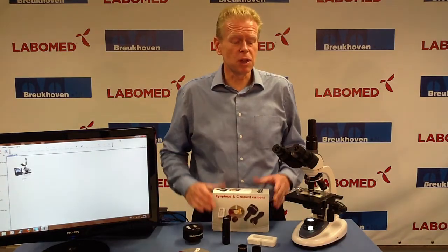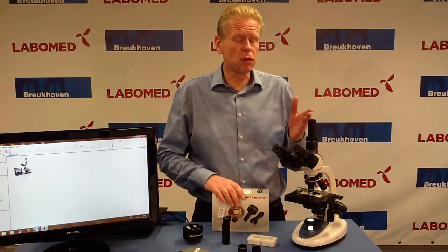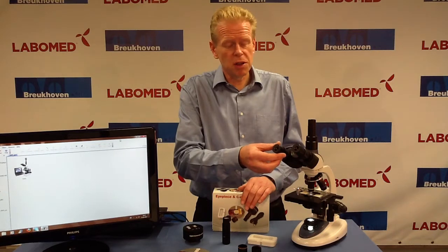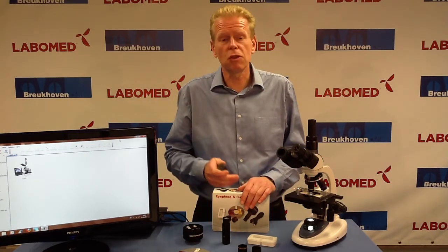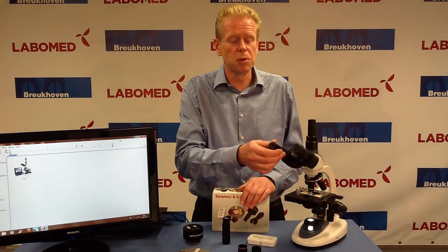Eyepiece cameras are cameras that you can use instead of the eyepiece or on the third tube. The basic idea is simple: you take out an eyepiece, you put in the camera, and you grab the image on your computer.